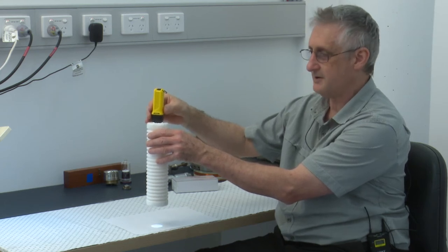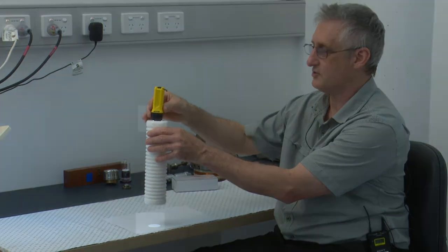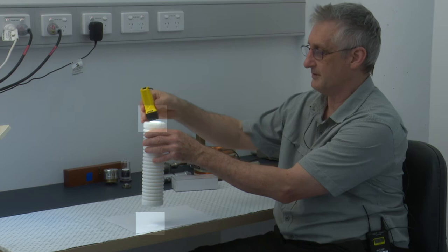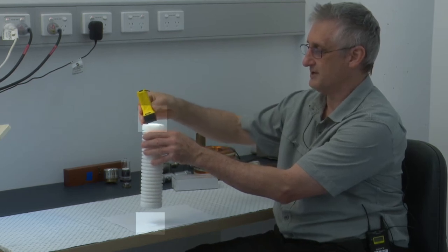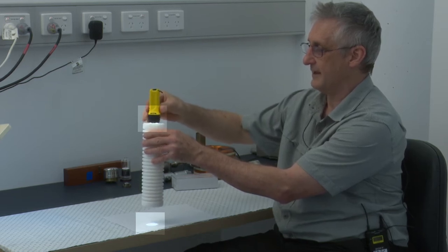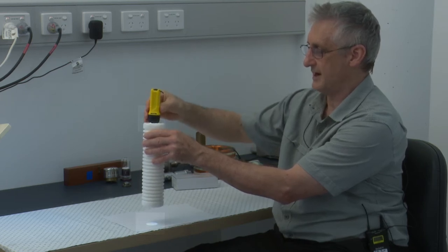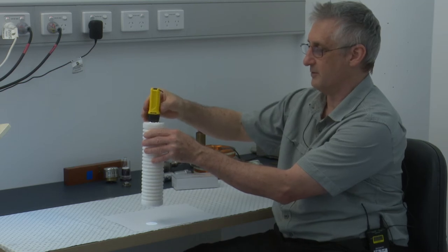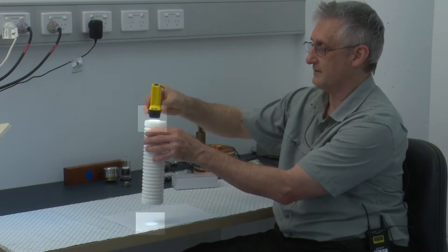There are two main components that are required for gun alignment. There is a component called the gun tilt. Gun tilt is simply tilting in that direction. We can call that the X direction. You can see we're losing signal as we get off axis. X direction and Y direction. So if you adjust the tilt, X and Y, you can maximize the illumination and center the beam. The other component that's important to adjust is the gun shift, and that can be X and Y.